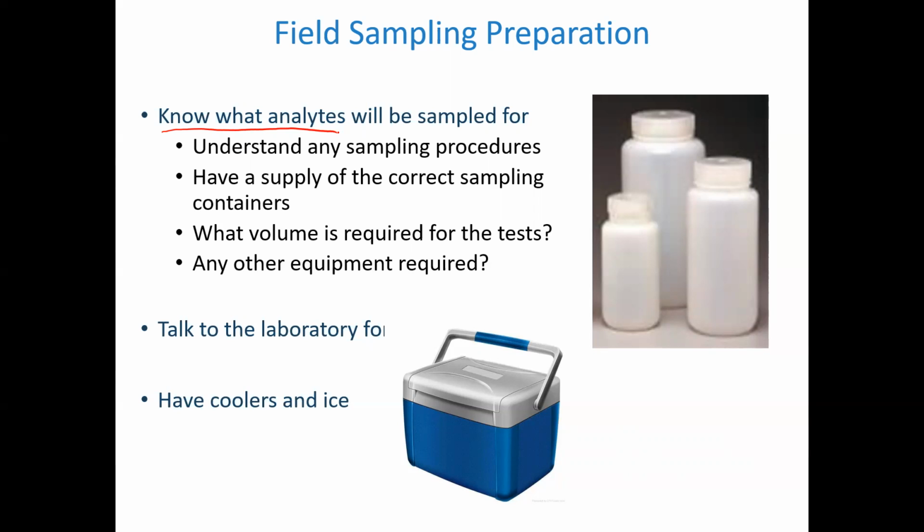Notice this basically says, talk to the laboratory, and the rest of the text says, before you go out. And most protocols are expecting you to store your samples on ice because that's keeping things fresh and refrigerated, and then there's no worry about heat or anything like that ruining the samples. Again, it kind of depends on what you're testing for again.